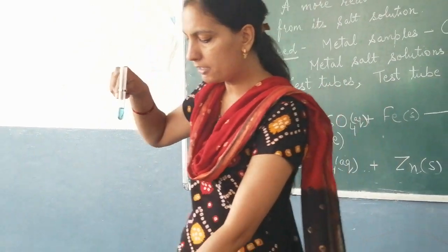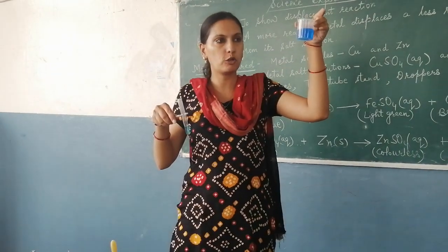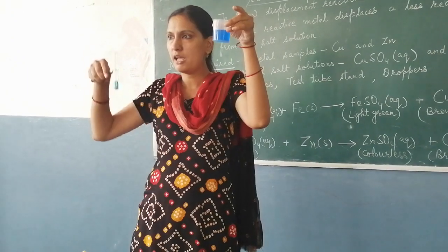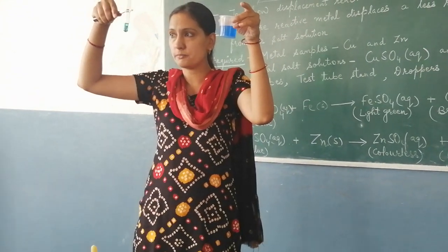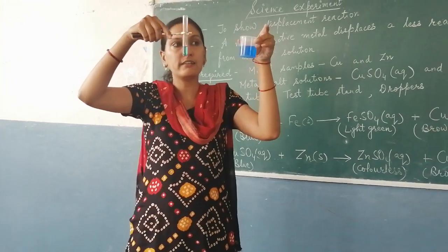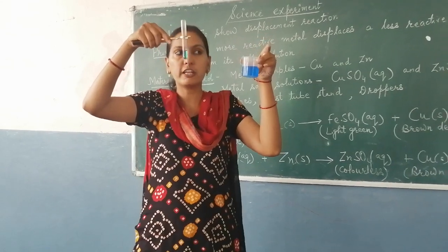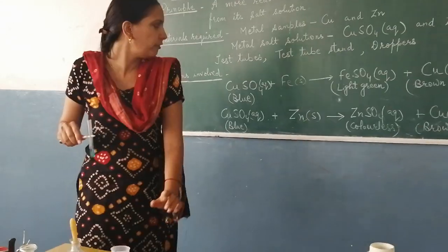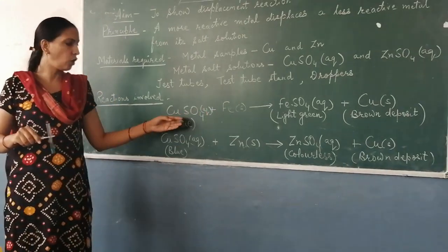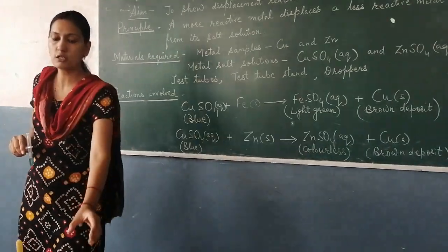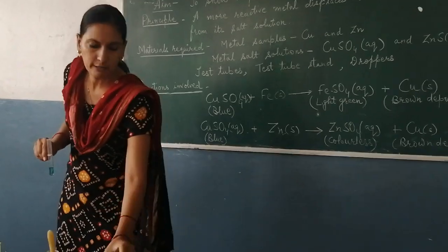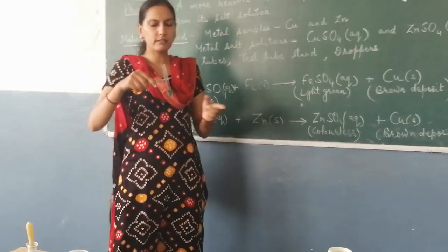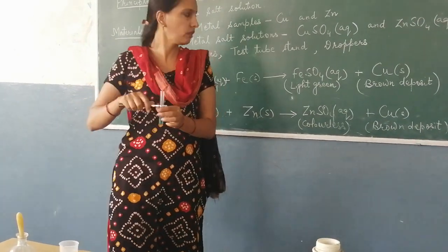I have prepared copper sulfate solution. This is the color of copper sulfate solution - can you see it is blue color? And what is the color of this solution? This is actually light green color, a shade of greenish. So when we put an iron nail in copper sulfate solution which was blue in color, it will change into light green color.